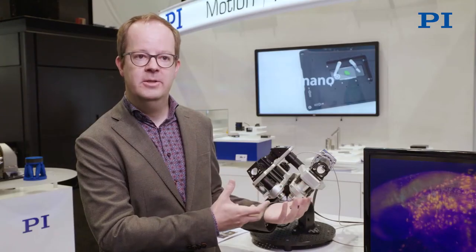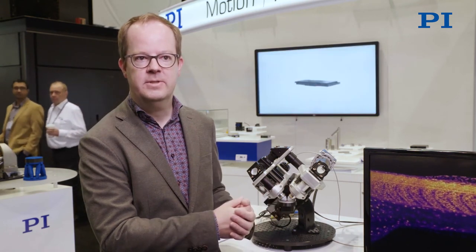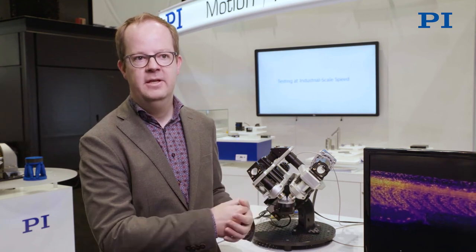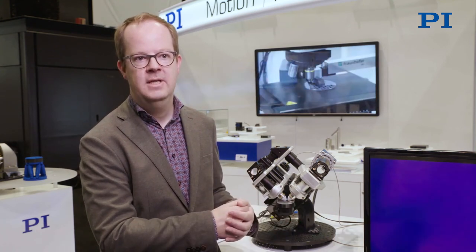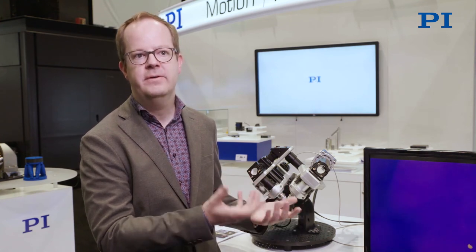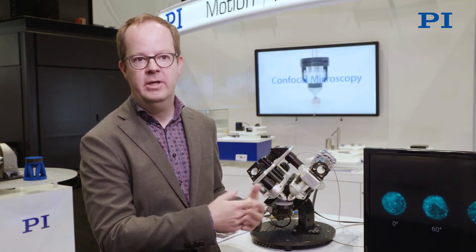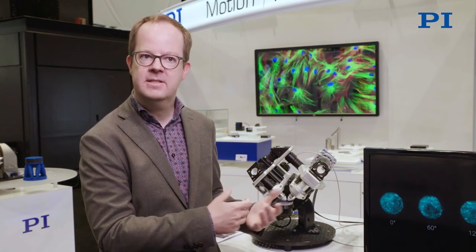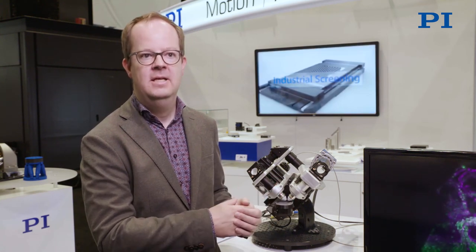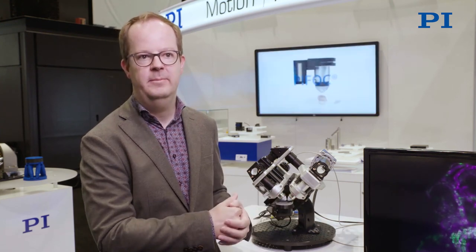With the partnership with PI, it allows us to custom design these instruments more precisely and use the best in micropositioning for these high-resolution microscopes. The flexibility of the system allows us to use different components from them in the best possible way. We've been partnering with PI for a long time, we've used their stages for a long time already, and we're very happy with their performance — that's why we decided to use them in the Flamingo as well.